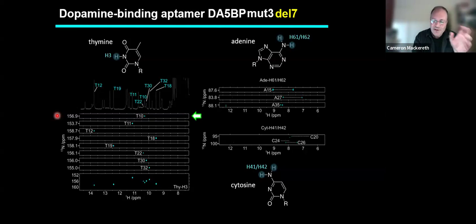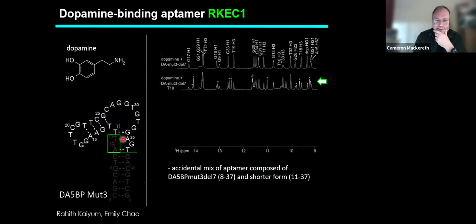And so we had a few little problems with the synthesis. But what it meant is that we had a mixture in some cases where we had the full oligo labeled on T10, for example, and some that were shorter. And as it turns out, the ones that were shorter. So for example, if you try to label on T10 and it doesn't work, your oligo, the way you synthesize it, starts at the 3' end, and you synthesize it around like this, and then it will stop at T11 if it doesn't work for the labeling at T10.